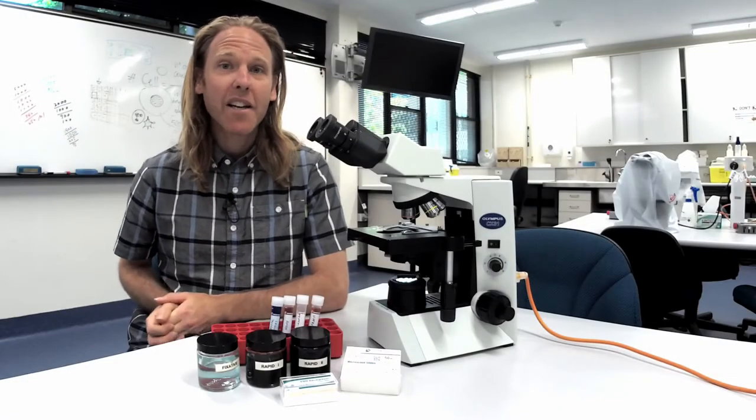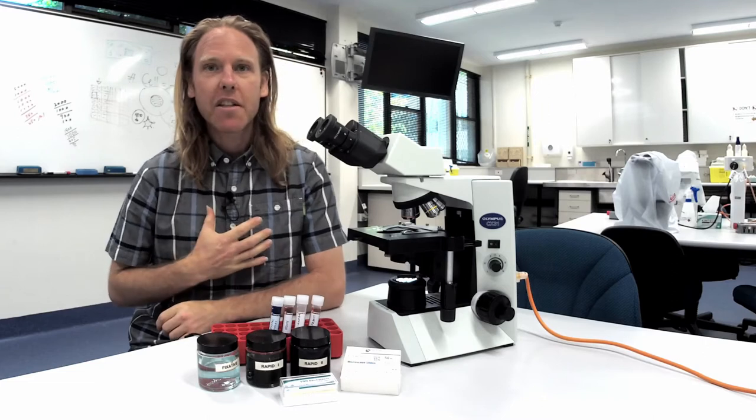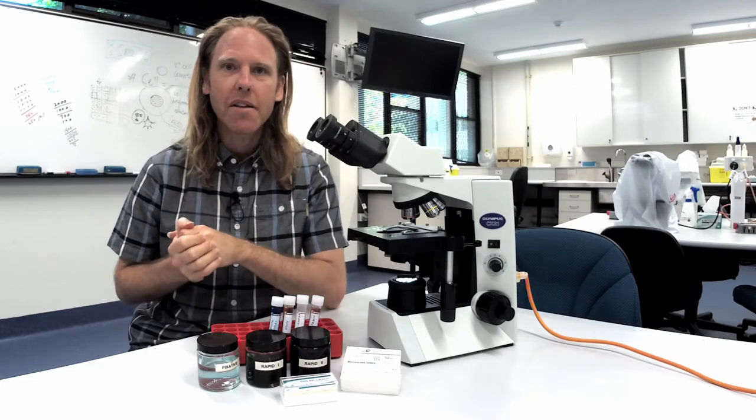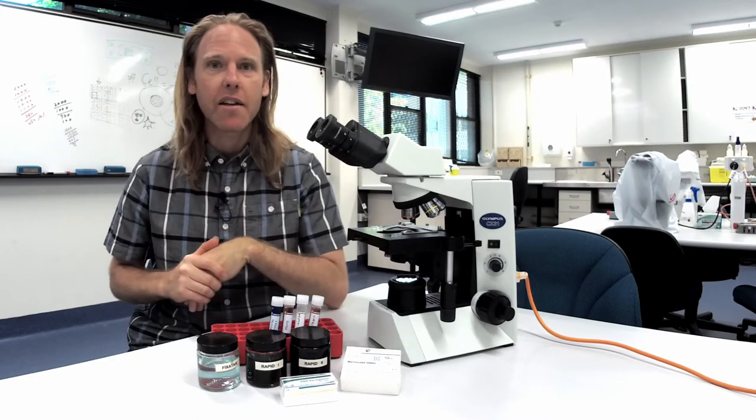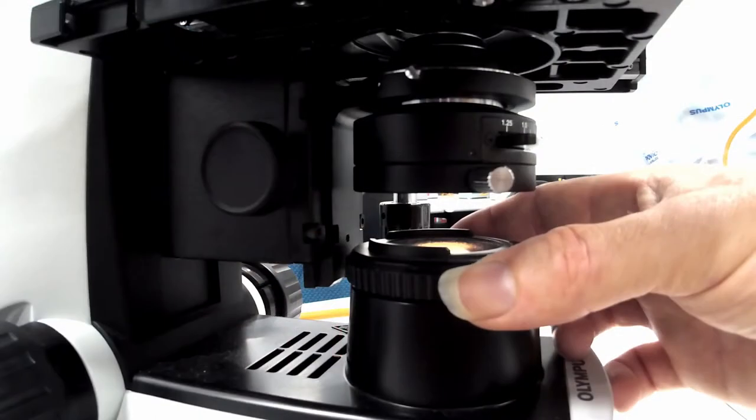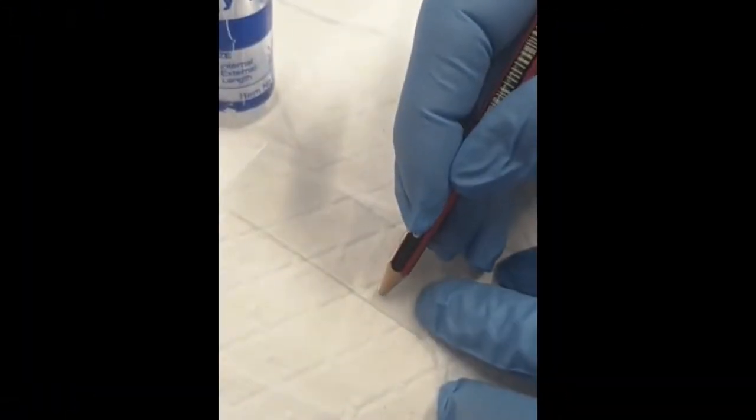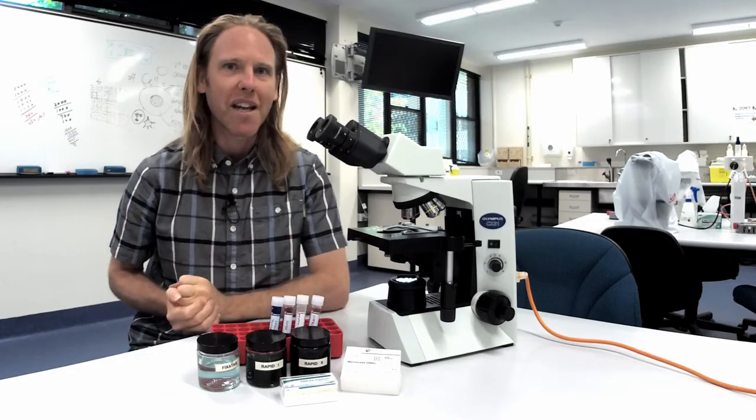Hello and welcome to practical cytology brought to you by the AMR Vet Collective. My name is Patrick Shearer and I'll be taking you through some basics to get the most out of your cytology both in-house and when submitting to the diagnostic lab. We'll be going through the basics of microscope setup and maintenance, sample handling and some general tips to get the most out of your diagnostic decision-making process.